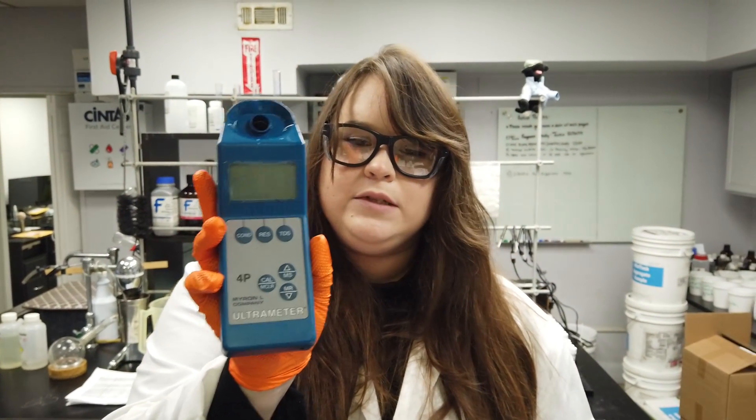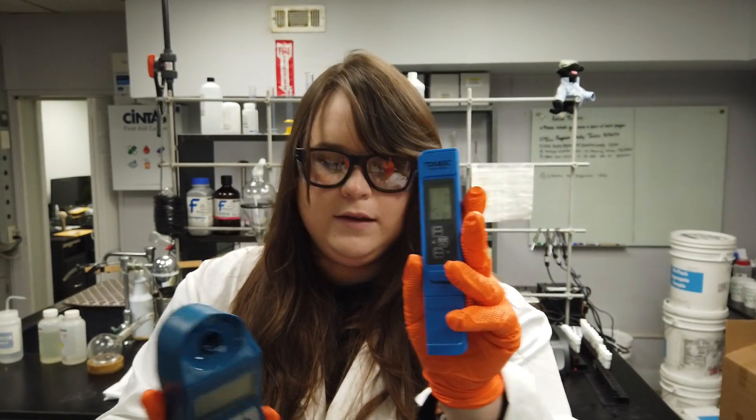There are multiple different types of conductivity meters. I'm going to be using this one today, but you might also have one that looks like this.